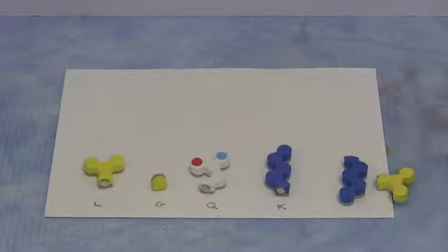So let's consider what's actually happening in our paper chromatography. As an example here, I've got 4 standards: leucine, glycine, glutamine, lysine, and then we have our hydrolyzed dipeptide, with 2 separated amino acids, and we don't know the identity of them yet.